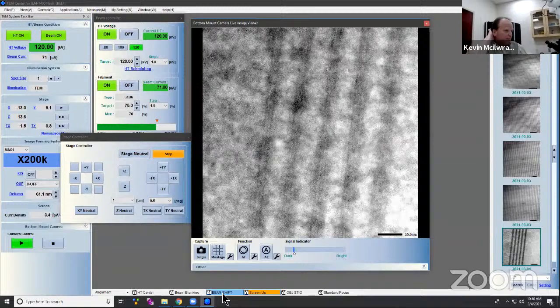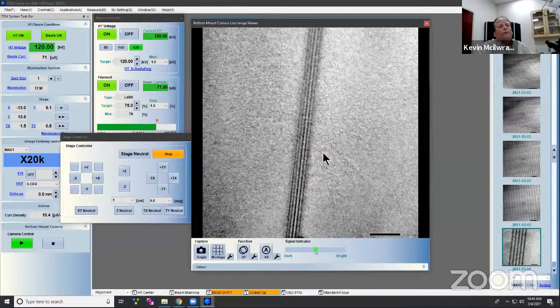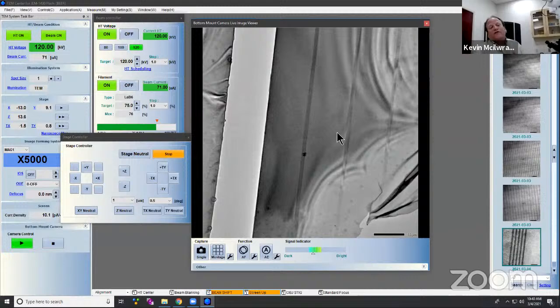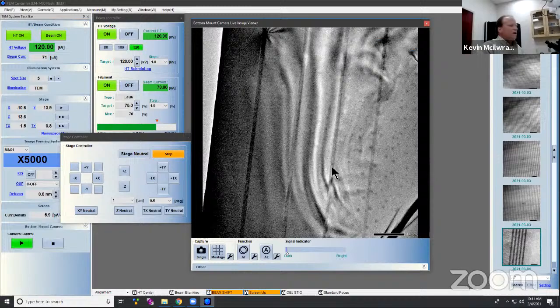But you can see, I'm looking here at mainly single crystal type stuff. This is a single crystal of silicon. And so I typically can get a nice convergent beam pattern, or I can get a nice single crystal pattern, but I'm not going to see polycrystalline information, which is more of a ring. Now, if we look back at the convergent beam pattern, right? So I move this.